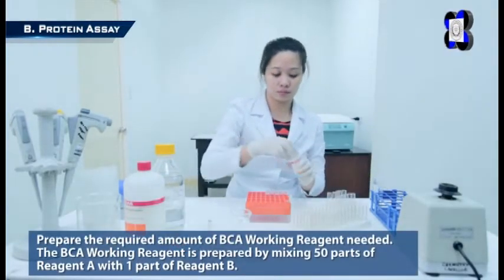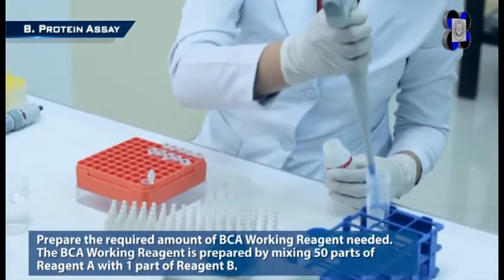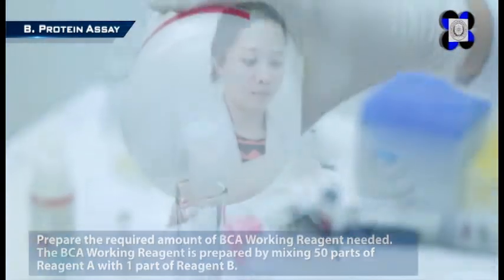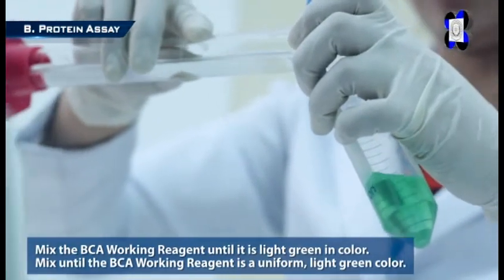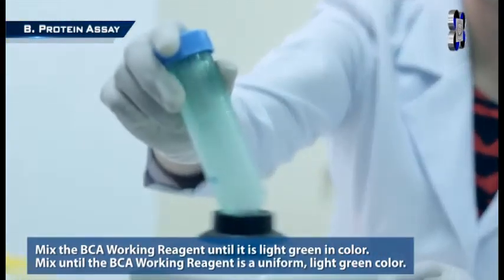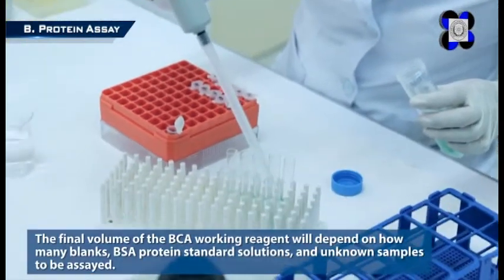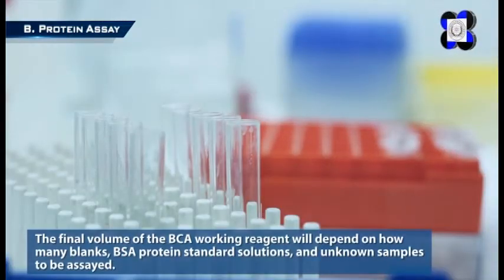Step 3: Prepare the required amount of BCA working reagent needed. The BCA working reagent is prepared by mixing 50 parts of Reagent A with one part of Reagent B. Mix the BCA working reagent until it is a uniform light green color. The final volume of the BCA working reagent will depend on how many blanks, BSA protein standard solutions, and unknown samples are to be assayed.